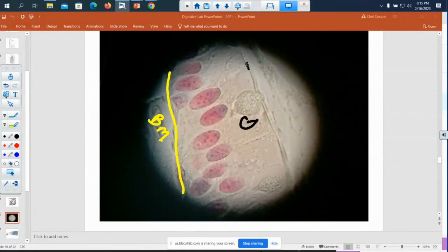G. That's a bad G. Let's rewrite it. There we go. Promised you last time I got gross and said, you'd see mucus, but it doesn't look bad. There it is. So it doesn't look bad.